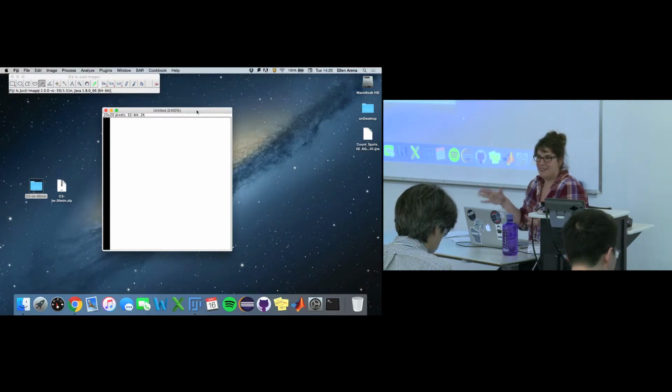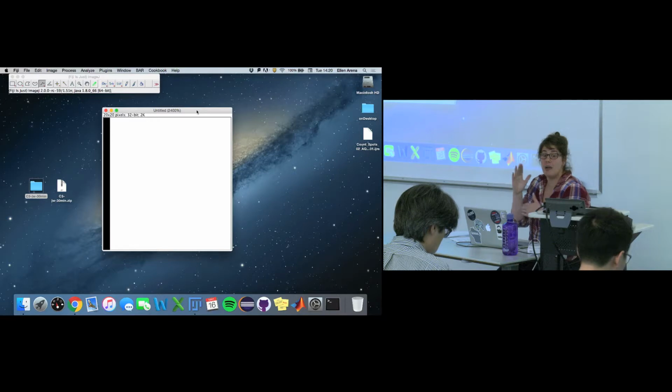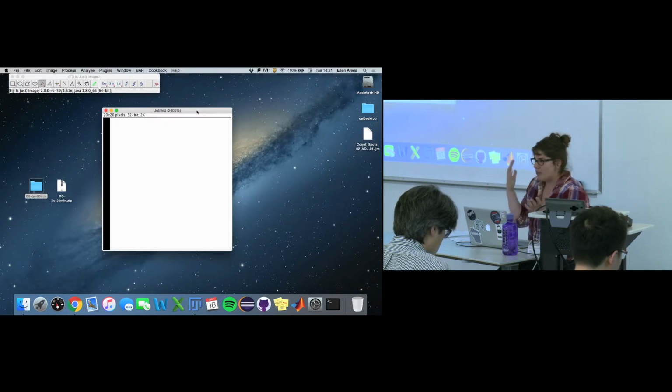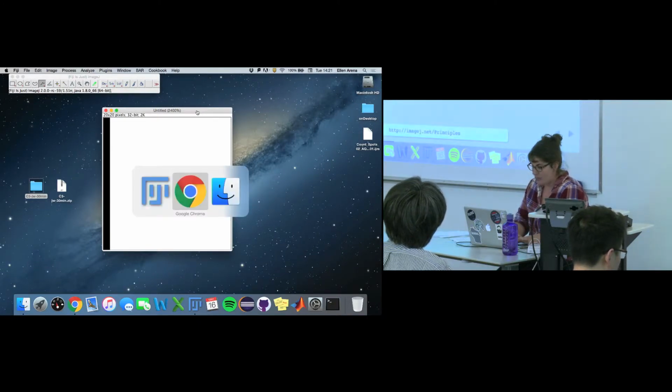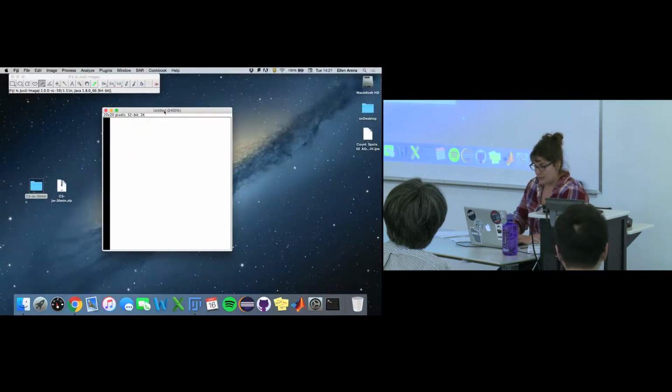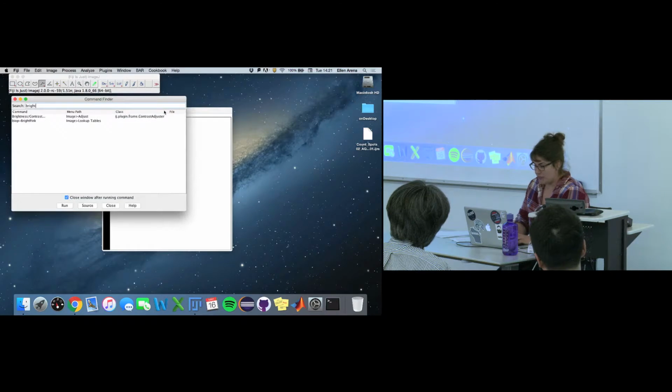Don't worry. It's just a display thing, because previously we were just looking at pixel values from 0 to 1. Now we're looking at pixel values, in theory, from 0 to 100 million. So this is just a viewing thing, a display thing. The first thing you should think is, nothing wrong happened with my data. The only thing I need to do is adjust brightness and contrast. It's just a visualization thing.